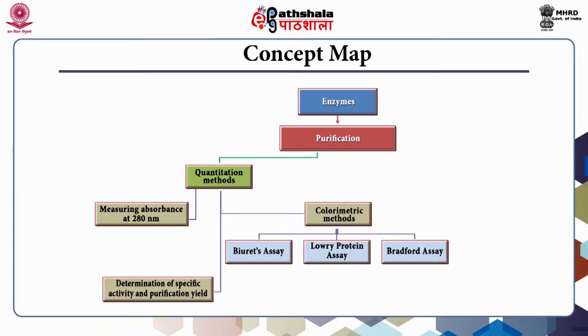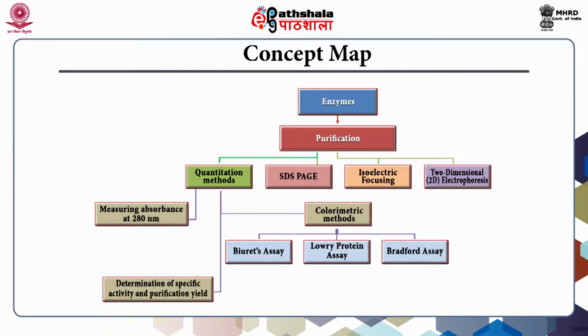In the next session, we will cover SDS-PAGE in detail, spanning an understanding of the gel matrix, the role of SDS and buffer system, the electrophoresis, sensitivity of SDS-PAGE, application and the staining techniques like Coomassie, silver staining and so on. We will also cover isoelectric focusing and 2D electrophoresis briefly in this module.